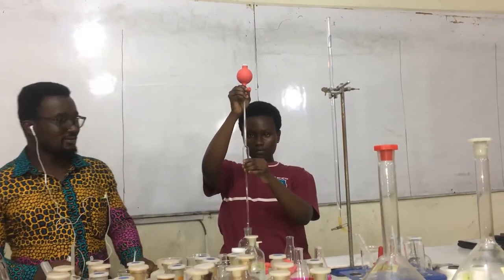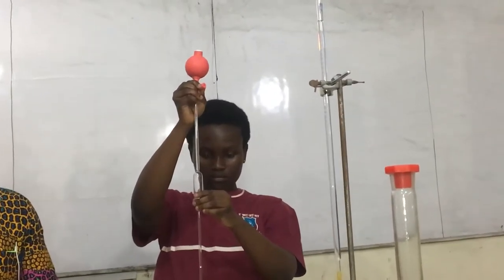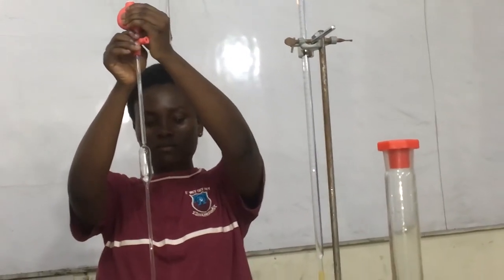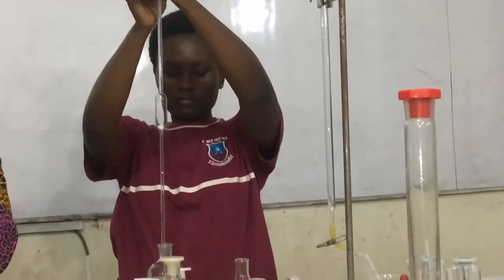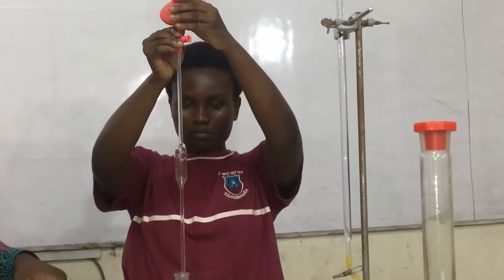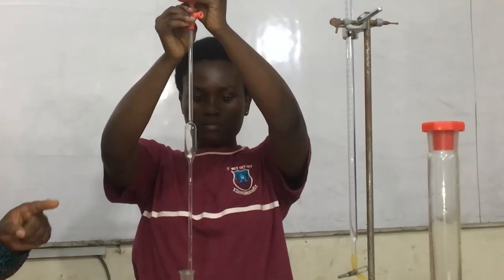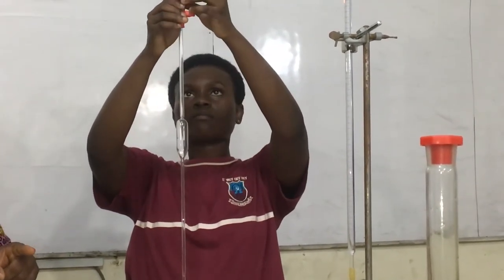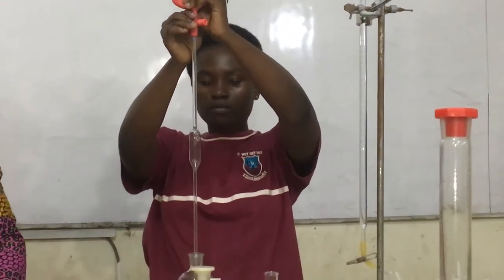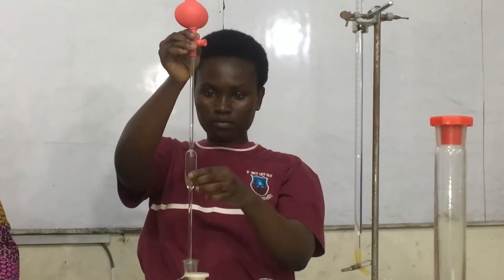See what has happened? Good. Our madam is very good. She realized that the pipette picked some few centimeter cube of air bubbles. So she has poured the solution back and then she's picking it once again. It has picked it again. The tip of the pipette must be totally immersed so that air bubbles will not be part.